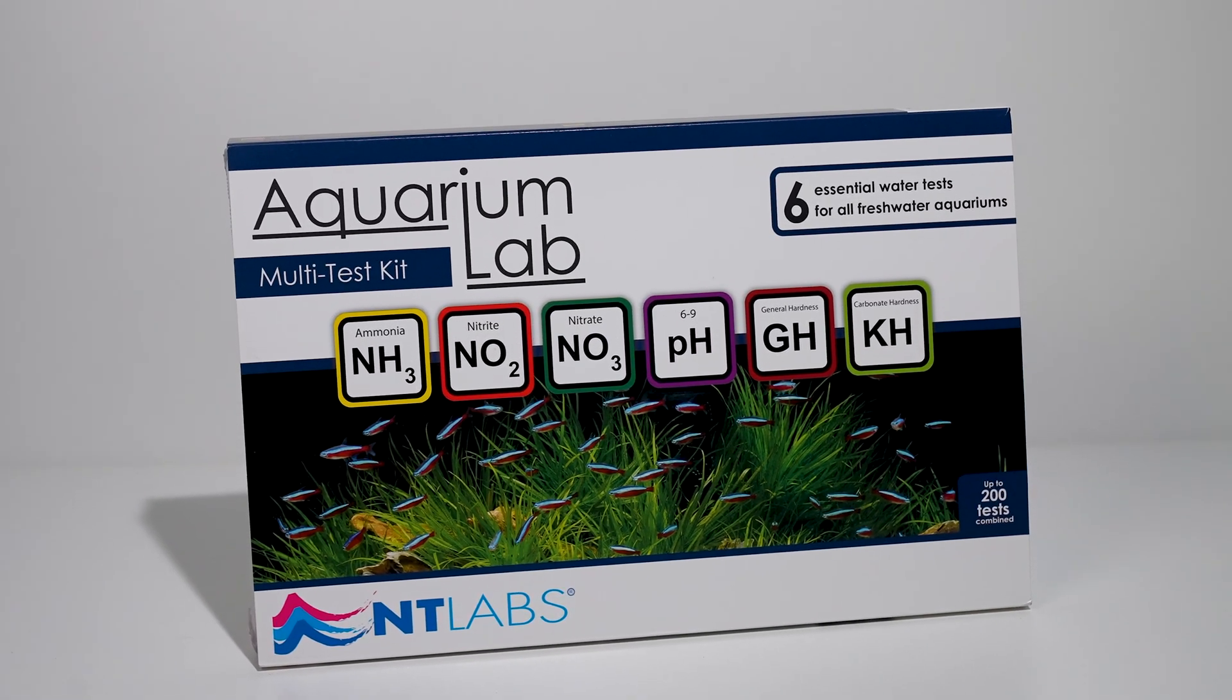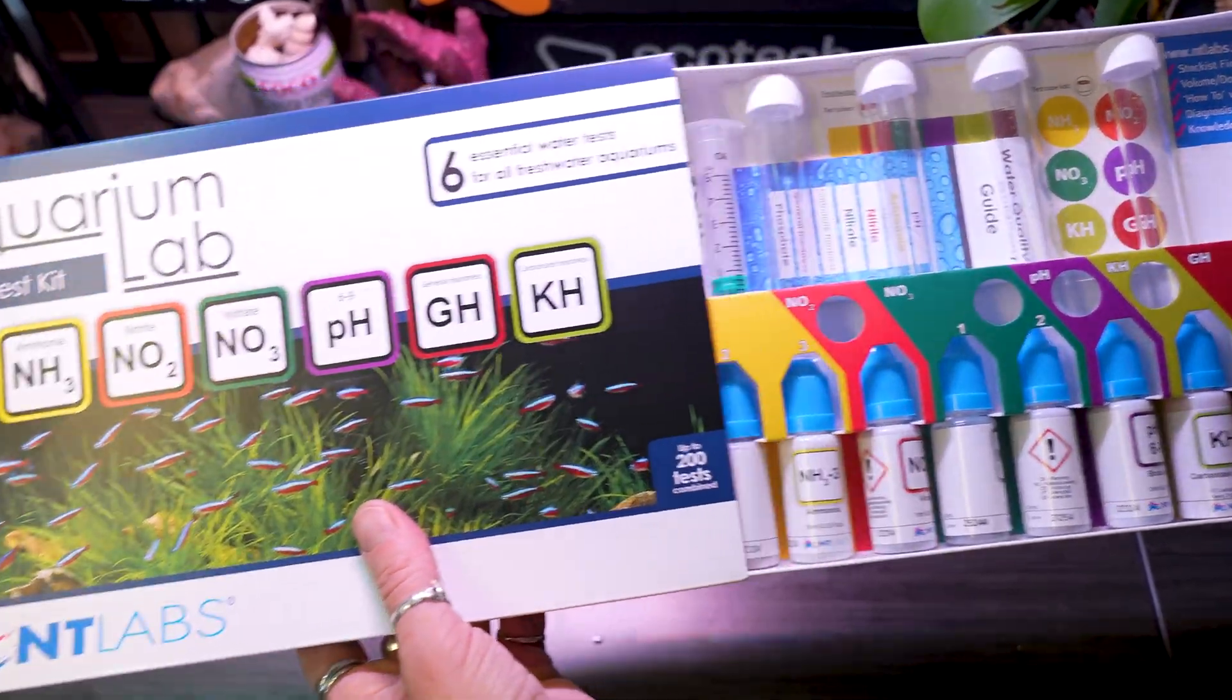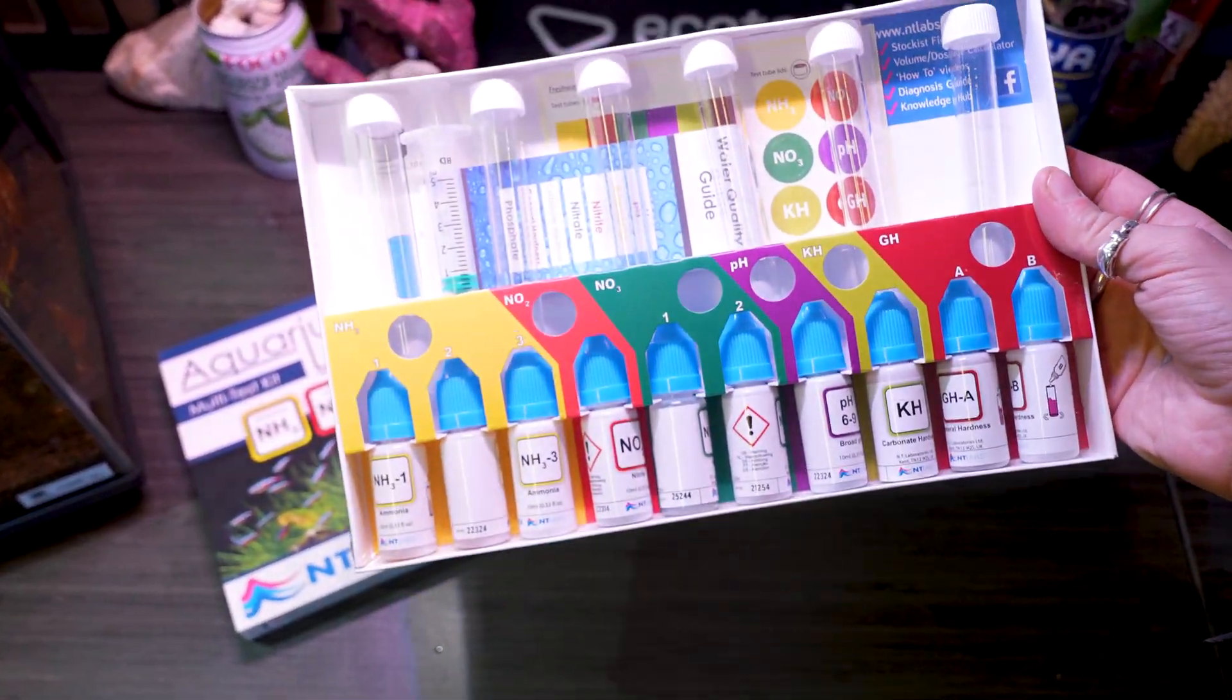Today we are going to be testing our aquarium water using the NT Labs multi-test kit. This is an all-in-one solution for maintaining optimal water quality in your freshwater aquarium.